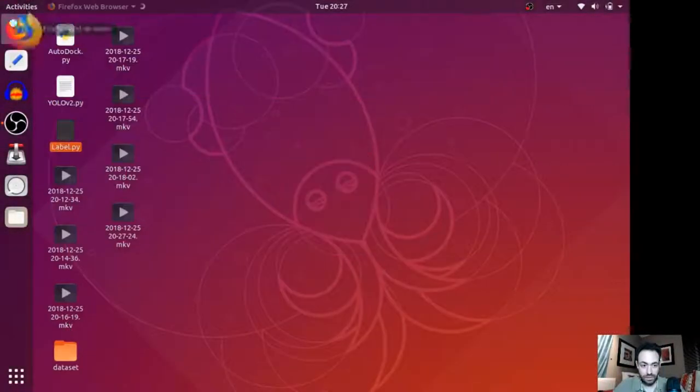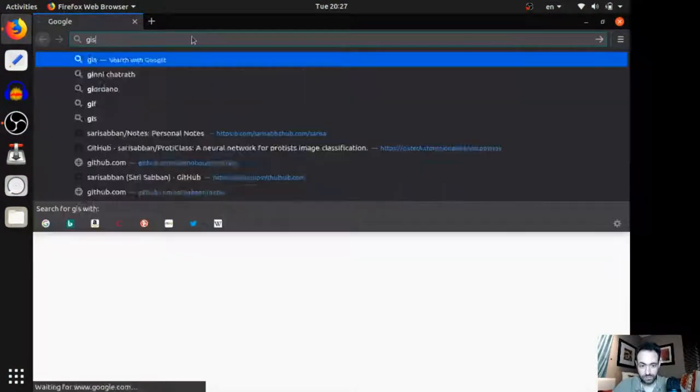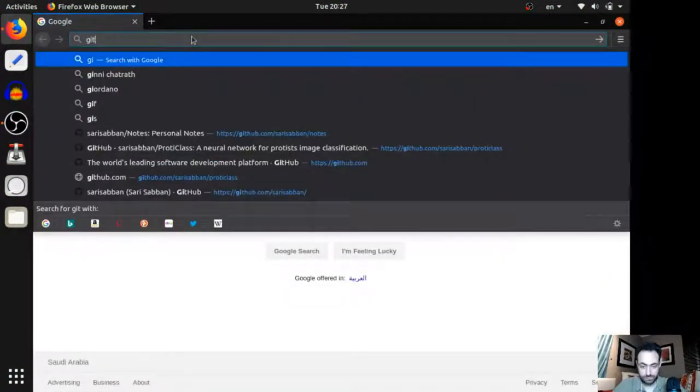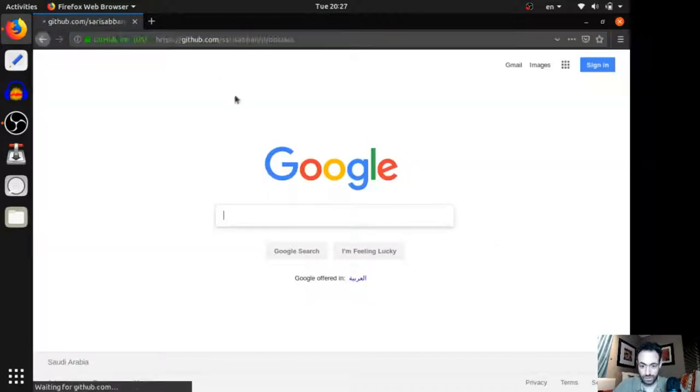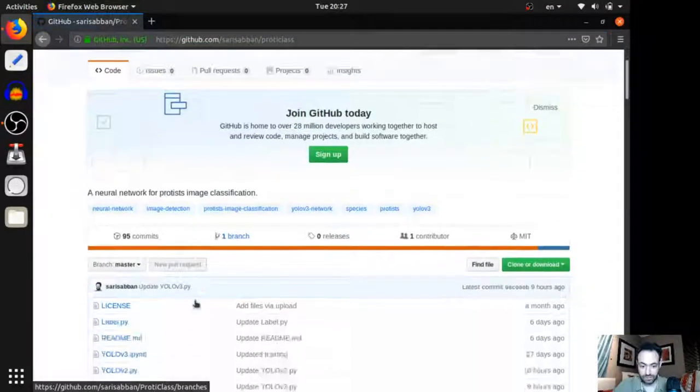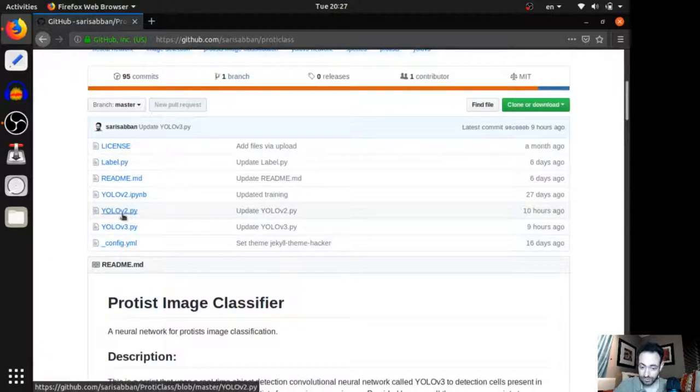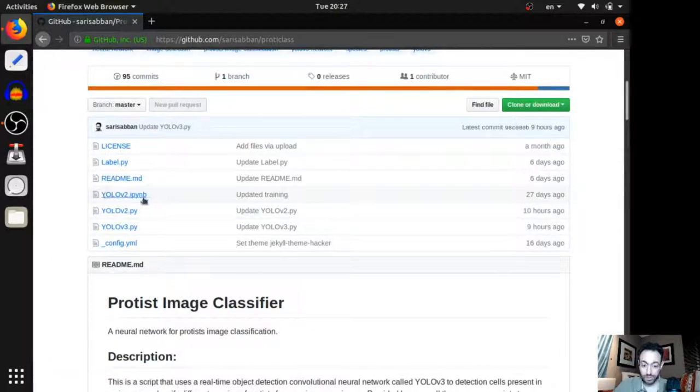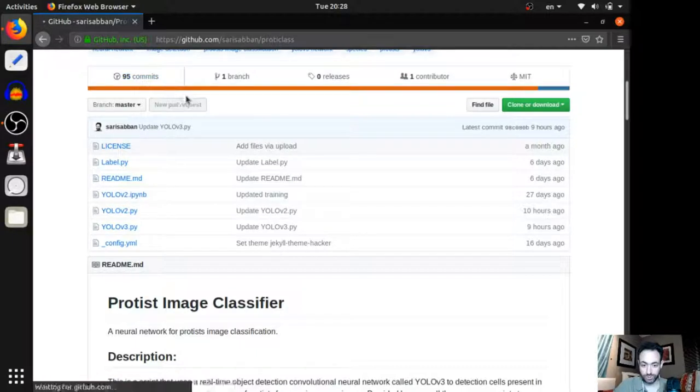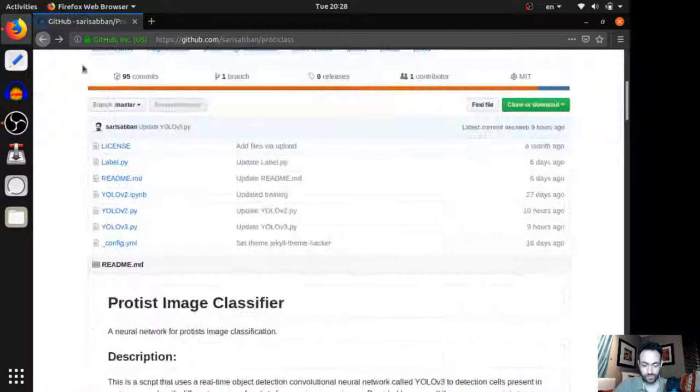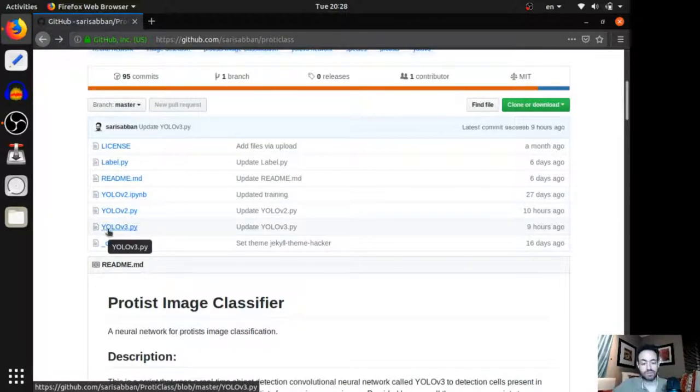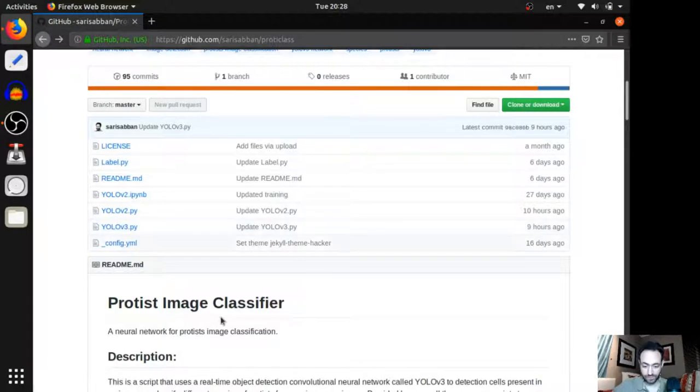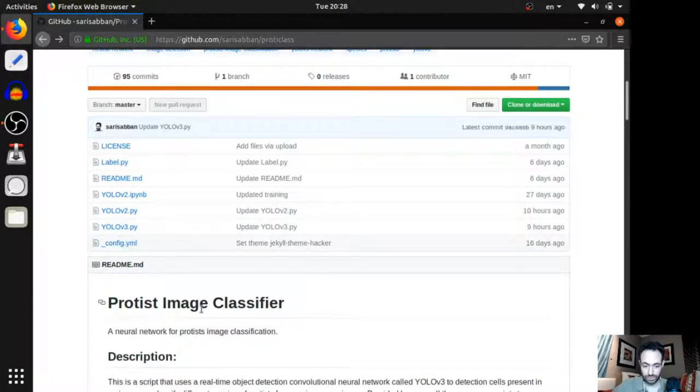You can go to my GitHub. And here is everything. You can see the YOLO version 2 Python script, which I haven't written. I just modified a little bit. And if you want to run it on collaboratory, Google's collaboratory, I have provided a Jupyter Notebook file for it. There is also the YOLO version 3. But this neural network requires a larger system. So, it can't run on Google's free GPU service.